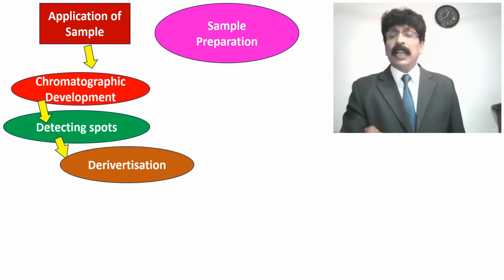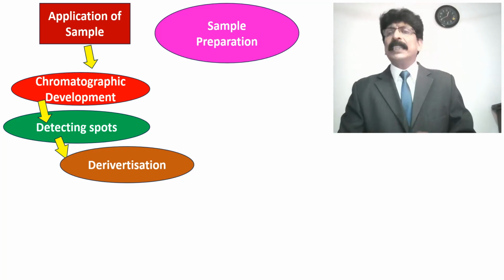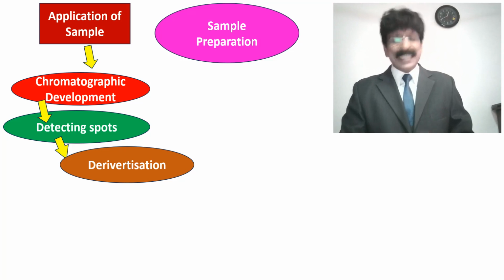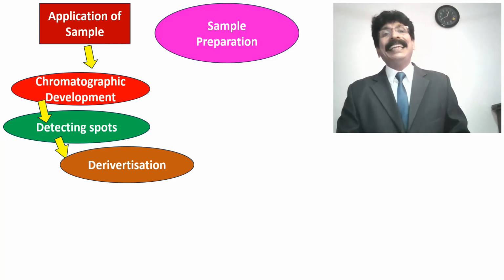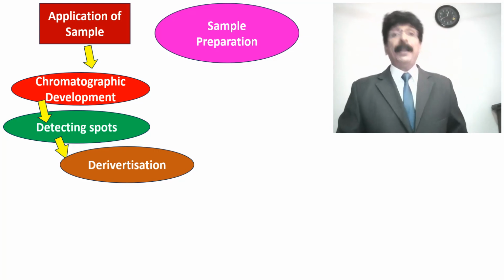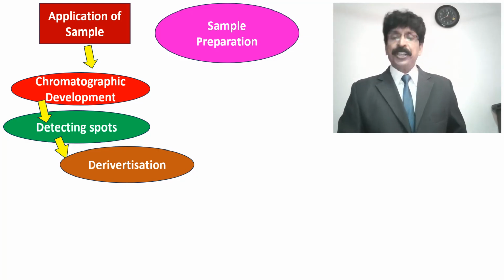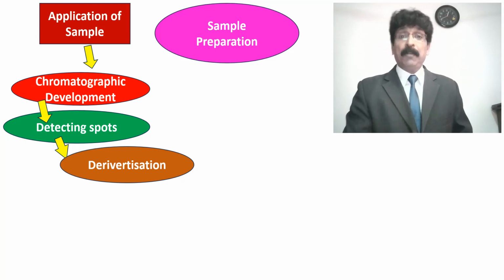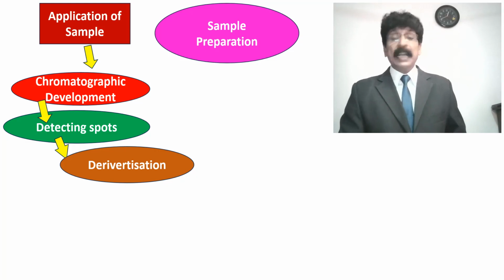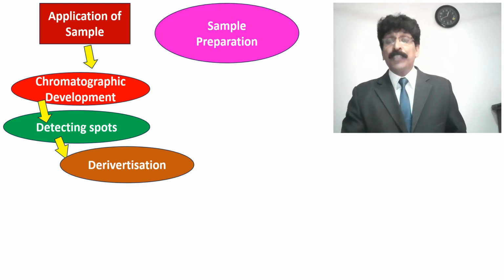Derivatization we did not do there. Here derivatization is done. Derivatization means fixing the spots, fixing the separated compounds in the thin layer plate which you have received in the experiment, and can be done by means of polyethylene glycols. Natural derivatization solutions are available. I have added that example also in this lecture. So by that, how you fix the kymograph in your pharmacology by using colophony.